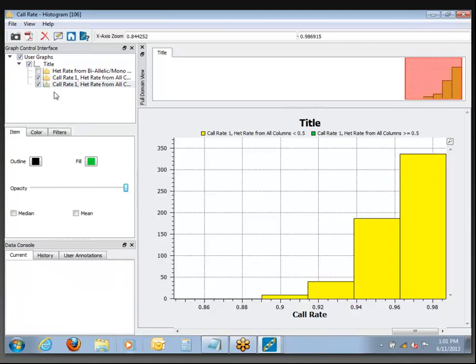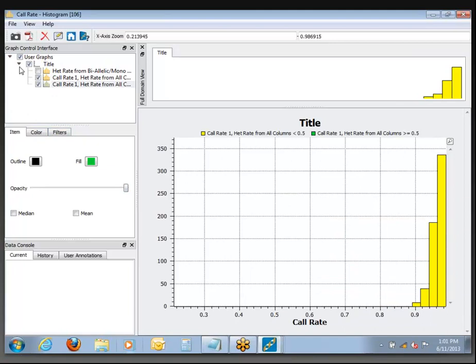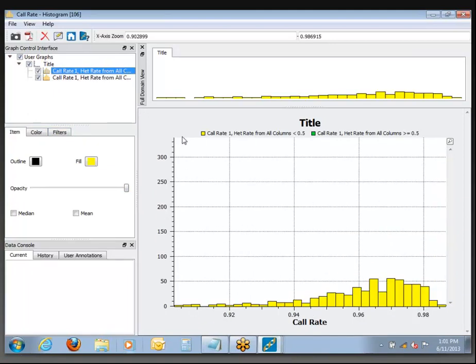You'll find that as you play around with the options, you'll be able to draw lots of different graph types, and there's a lot of control over how they're displayed.